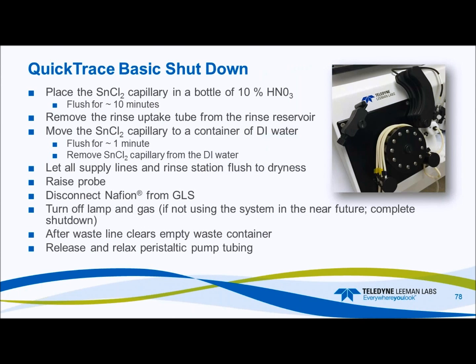Shutdown, a little bit about the shutdown. So for basic shutdown, you place your stannous chloride capillary in 10% nitric. We want to rinse for 10 minutes, then remove the rinse from the rinse reservoir, so we want that section to run dry, on the autosampler pump.